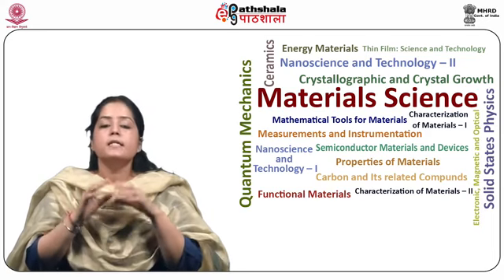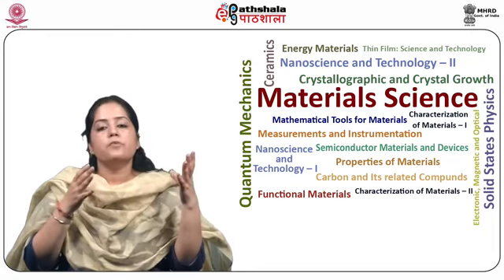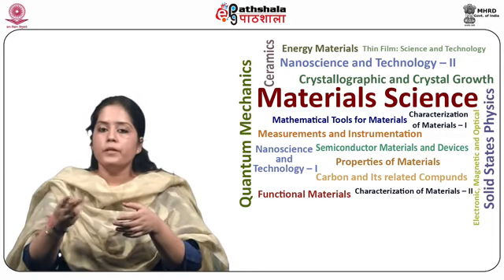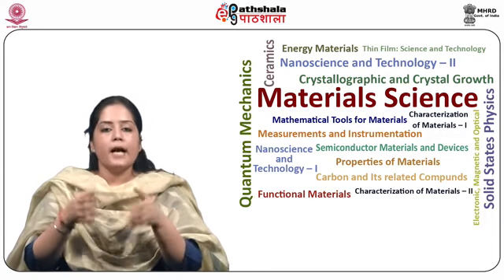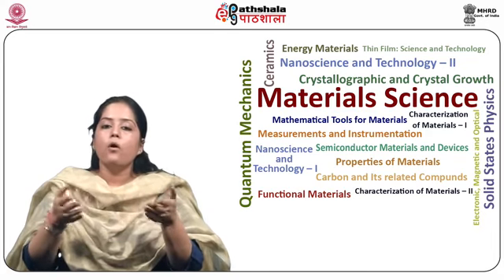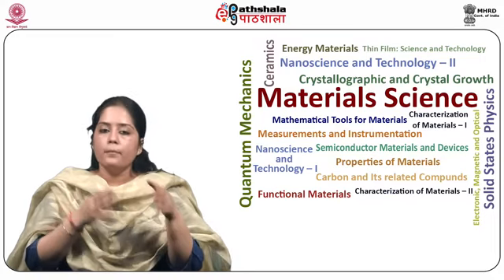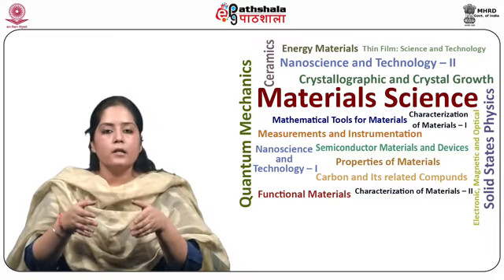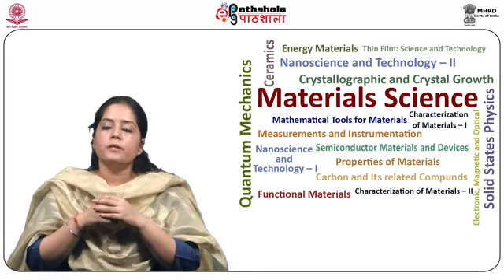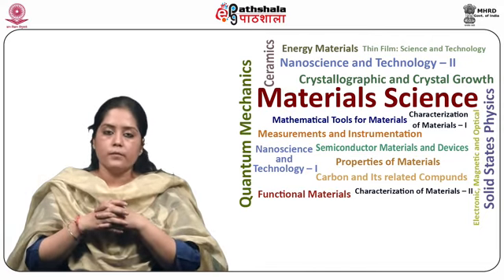Number one, techniques based on energy transfer between photon and a sample. Number two, reflection, refraction, diffraction, dispersion, or scattering from the sample, altering the amplitude, phase angle, polarization, or direction of the propagation of electromagnetic radiation.